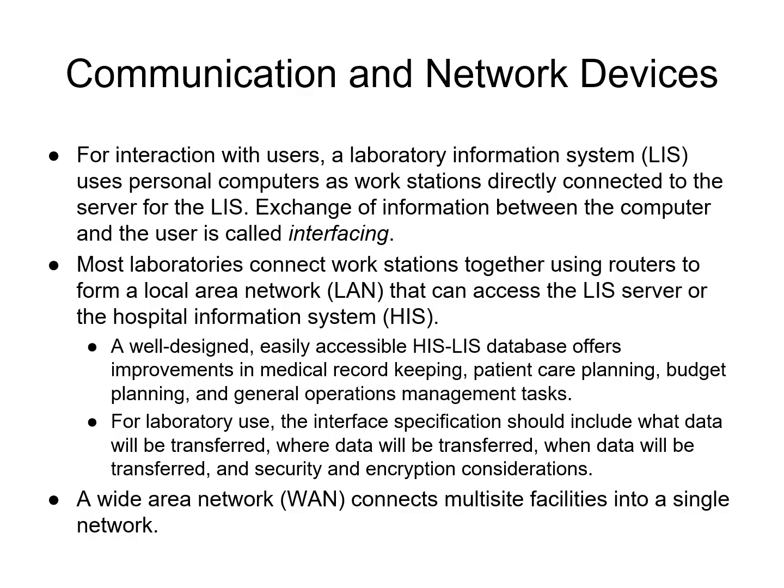Laboratory information systems, so user interaction. Personal computers will act as workstations that are connected to the LIS server. Information exchange between user and computer is called interfacing. Workstations are linked via routers, forming a local area network, or a LAN, accessing LIS or hospital information systems.